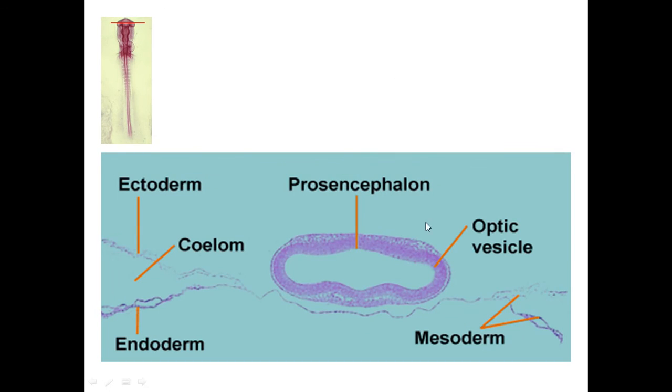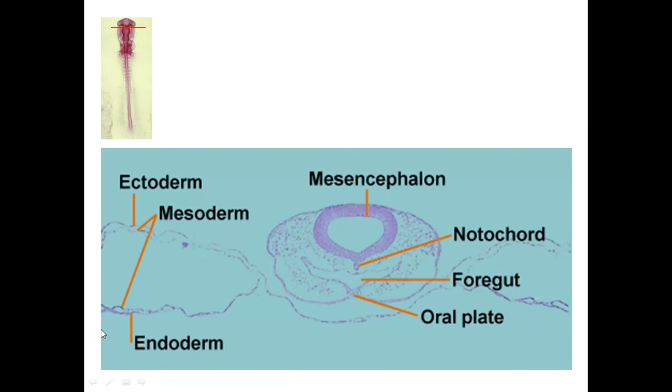Prosencephalon. This one is a more defined cut, where the lateral outgrowths are impressed. So we can see the optic vesicles emerging as lateral outgrowths from the prosencephalon. Let's go downward. Here we're seeing a cut made along the mesencephalon, the midbrain of the animal, and you are able to appreciate the initial part, the anterior part of the gastrointestinal tract, which is the foregut area of the animal.